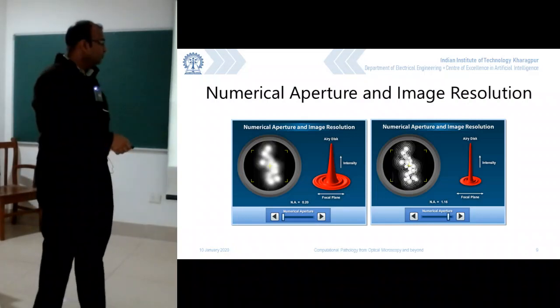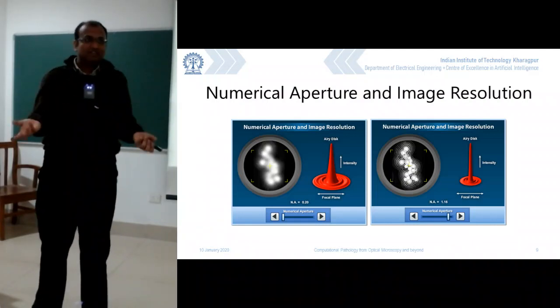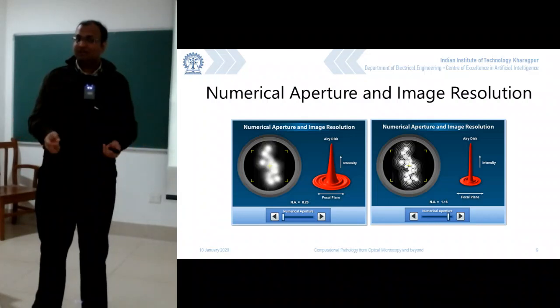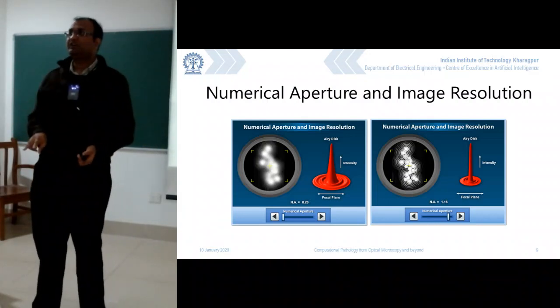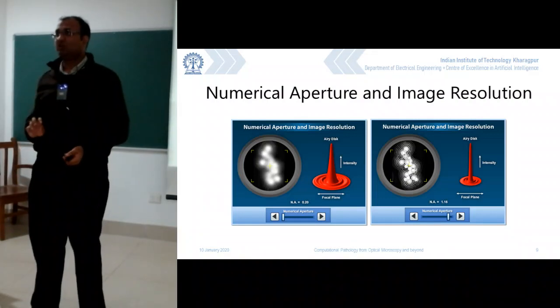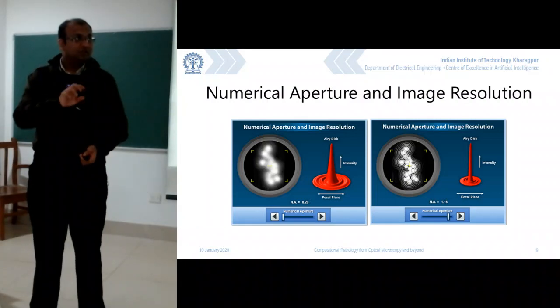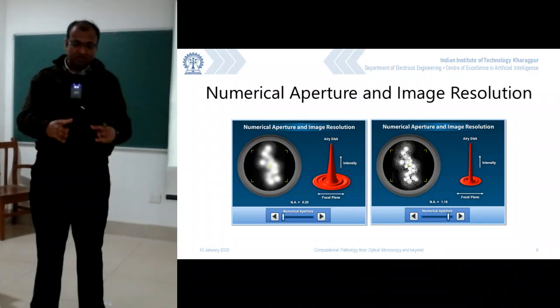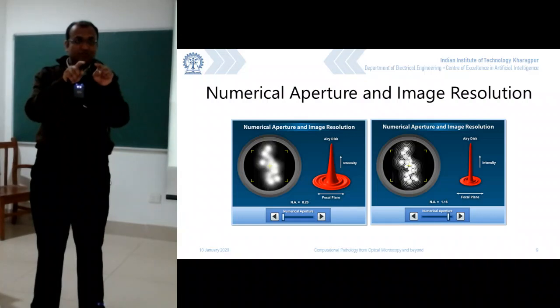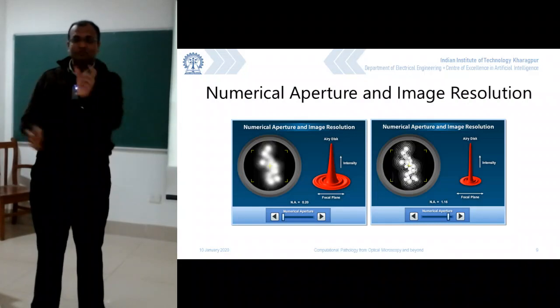Okay. So the moment your numerical aperture increases, because you have it closer to the lens, and your magnification also increases as a result, you will be able to discern very effectively between 2 points which are very much closer. Now there is another con associated with this. I've been able to very easily identify 2 points which are very close by and resolve between them. The problem is that because I am much closer to it, I am able to image only a much smaller section of my slide. My slide might be this big, and I am able to look only at a smaller region.